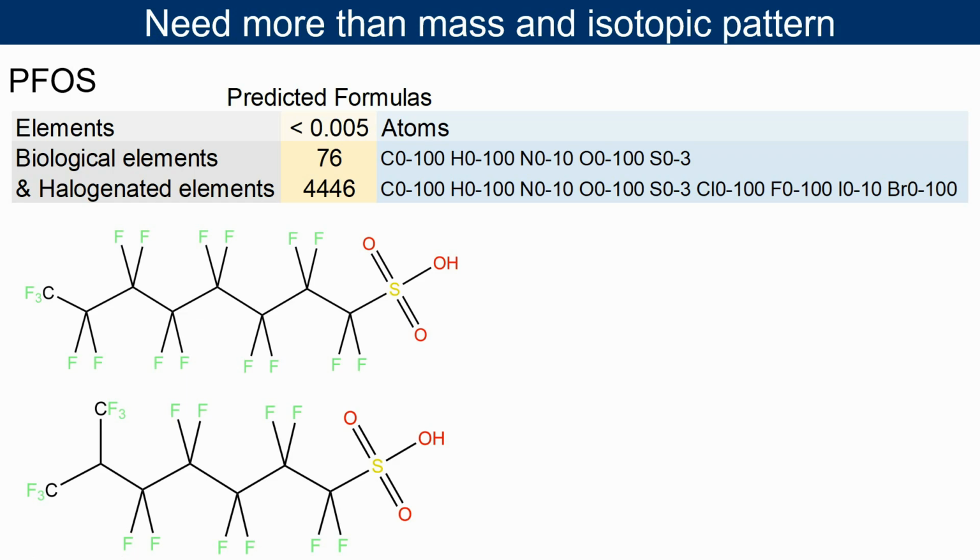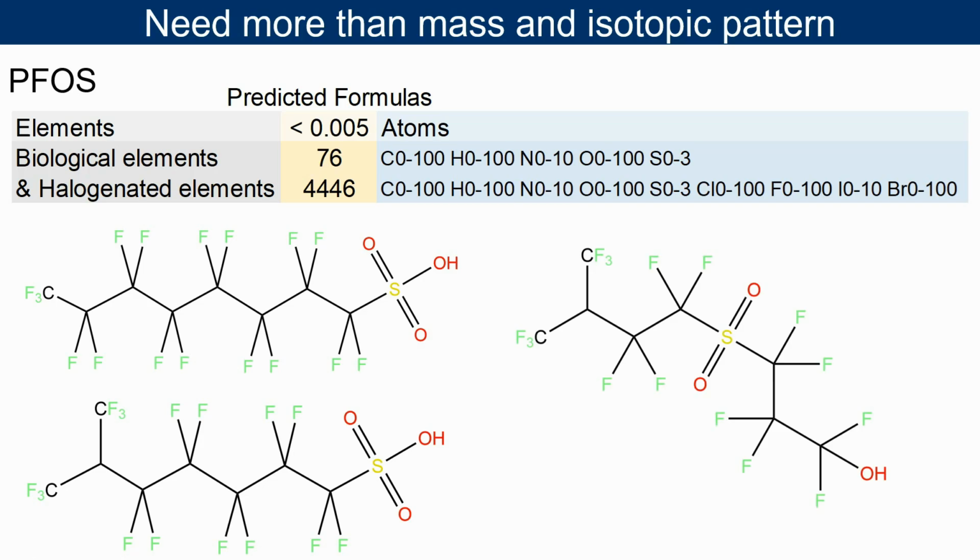And so it tells you something about source, history of the PFAS, but also might have different toxic effects. So knowing these subtle isomer differences might be important. There's certain drugs that have very subtle isomer differences that can mean the difference between saving someone's life or killing them. Here's another example of a structure that can be drawn with those same atoms following our Lewis dot structure principles and work perfectly as well.